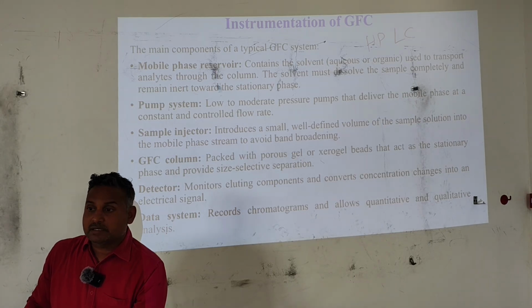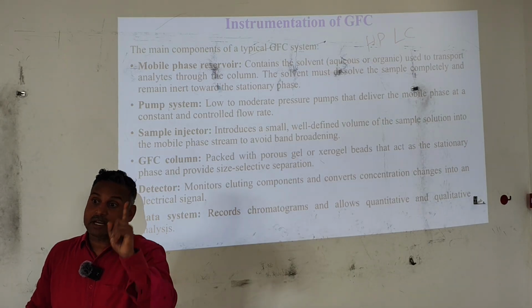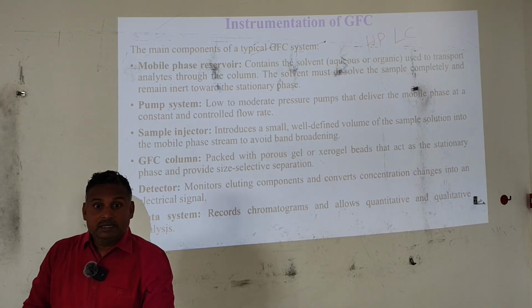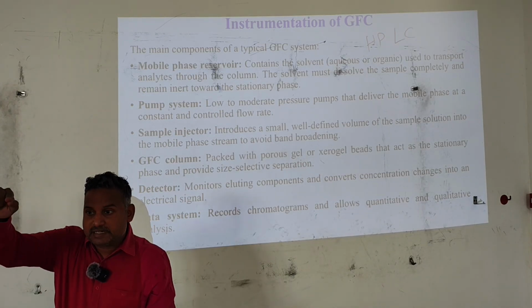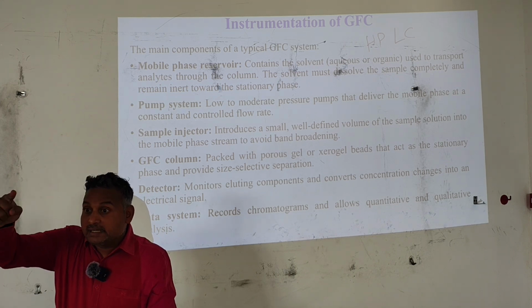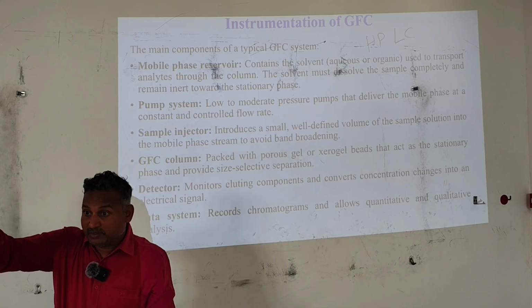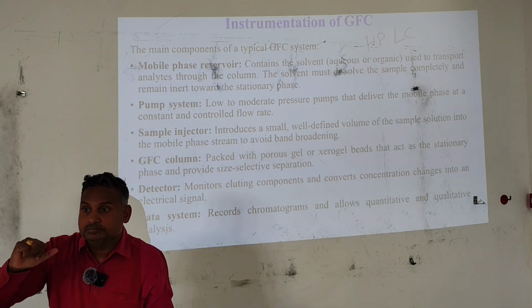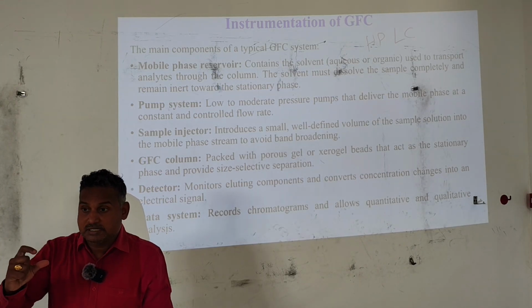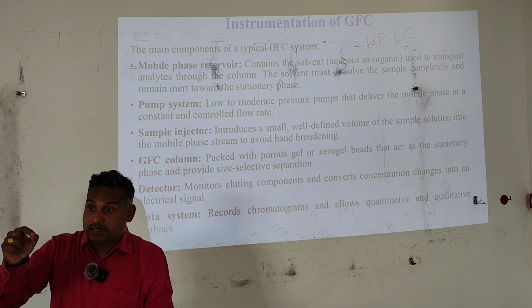HPLC is not a single technique. In the first chapter, under classification, I told you that in HPLC we have different varieties. Okay? LSC, liquid solid chromatography. LLC, liquid liquid chromatography. Ion exchange chromatography, if you use an ion exchange column. Gel permeation or size exclusion chromatography, if you use a gel containing column.